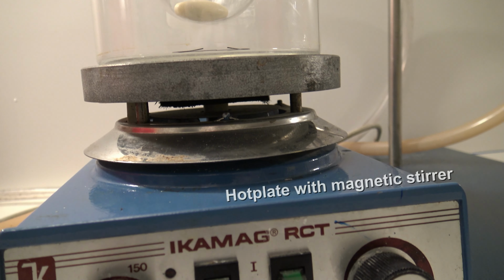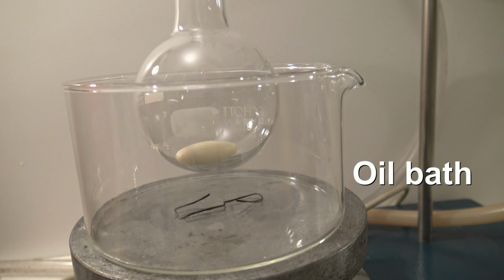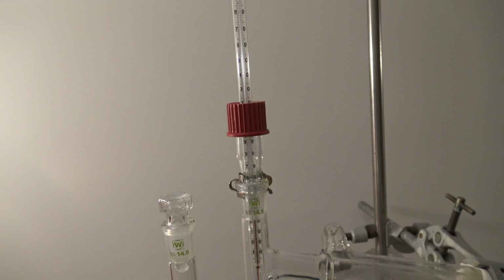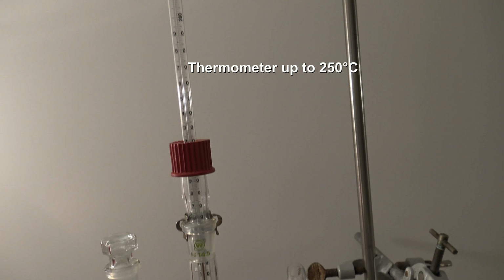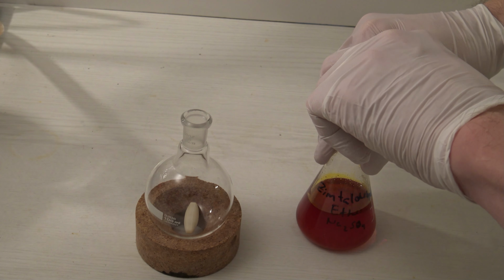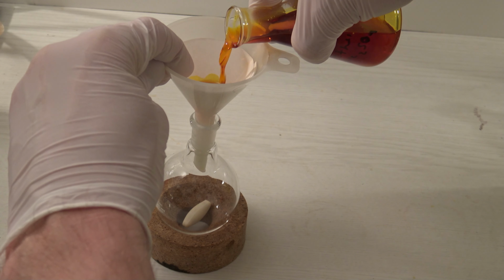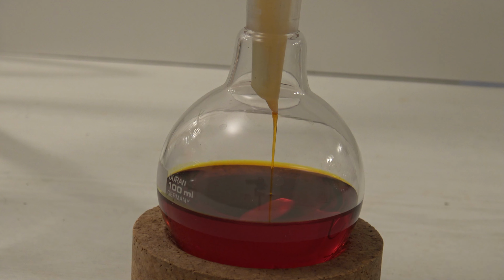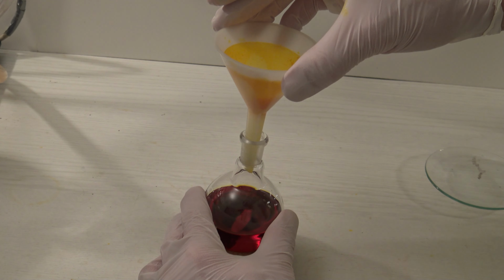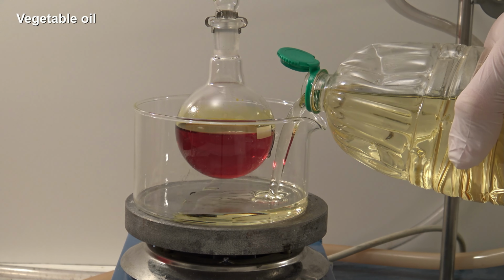Next, a simple distillation was set up with a hot plate and magnetic stirrer, an oil bath, a round bottom flask with a stirring bar, a distillation bridge, a thermometer that shows up to 250 degrees, and a receiving flask. Then the sodium sulfate was filtered off and the filtrate collected in the distilling flask. The Erlenmeyer flask was washed out with some diethyl ether. The flask was attached and the oil bath filled up.